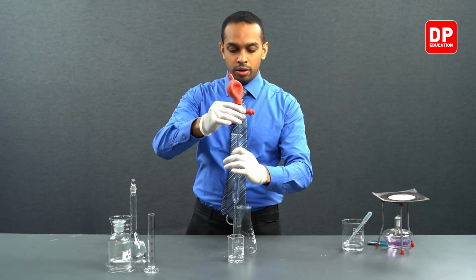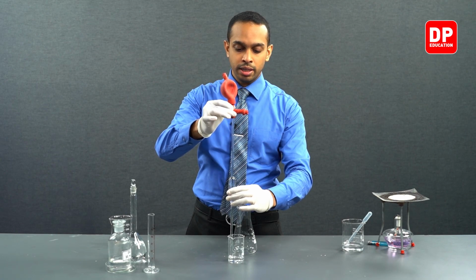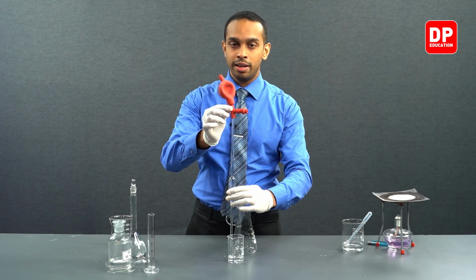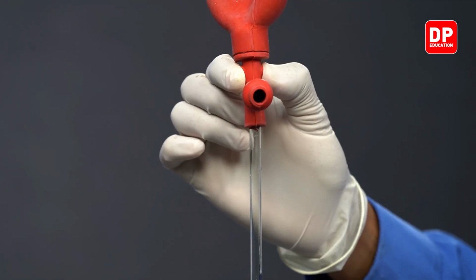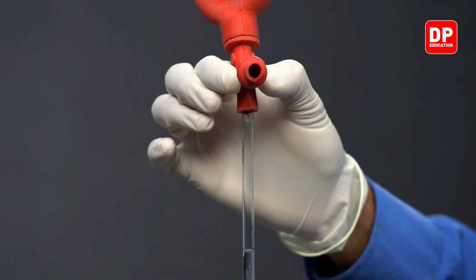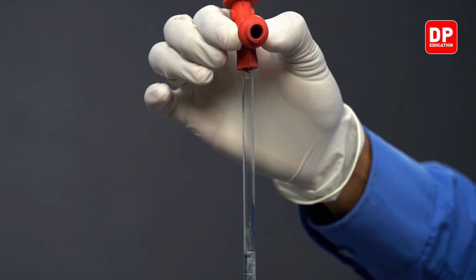Now, when you are using a pipette filler like this, you have the option of drawing in more solution like this, and you can release some with the help of these two buttons over here. These are actually valves. When I press this valve, it will draw in some of the solution, and when I press the other one, it will allow the solution to run back into the beaker.